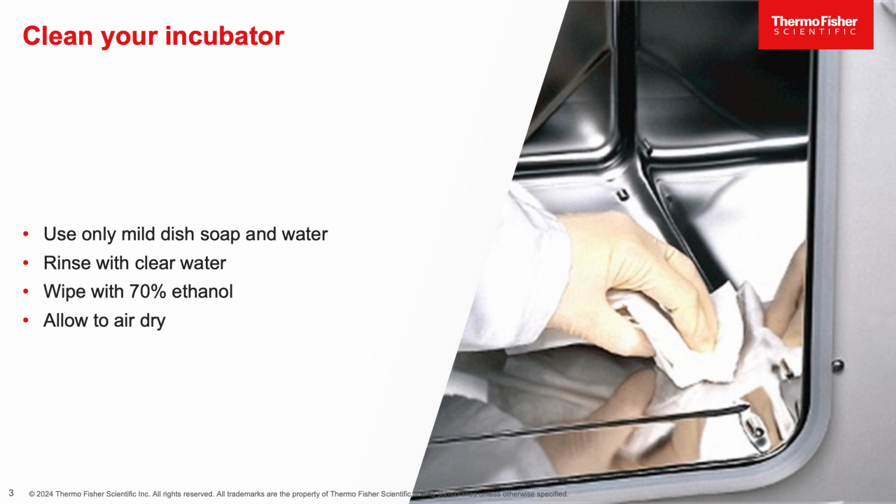We all know that cleaning a CO2 incubator is not the most fun job. So it's good to have a model of CO2 incubator that is easy to clean, with smooth chamber walls on the inside where the shelving components are easily removed, and you can put them back in easily too. Exactly, Mary Kay. Most incubator manufacturers recommend cleaning with a mild dish soap and water, a clear water rinse, followed with 70% ethanol and letting that air dry. The ethanol is not only a good disinfectant, but will also remove any residues that could build up over time.